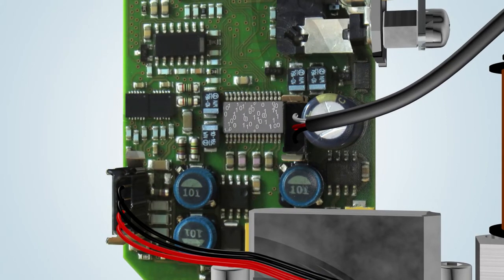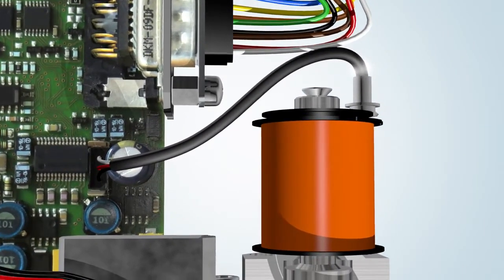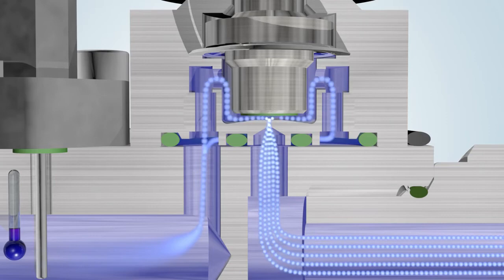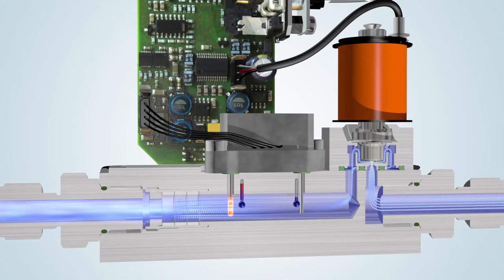The signal from the sensor is compared with the desired value in the microprocessor. The electric current of the coil is adjusted so that the distance between the plunger and the orifice is exactly right for controlling the desired quantity of gas. The control circuit performs this operation in a few milliseconds, achieving a very constant and stable flow of gas.